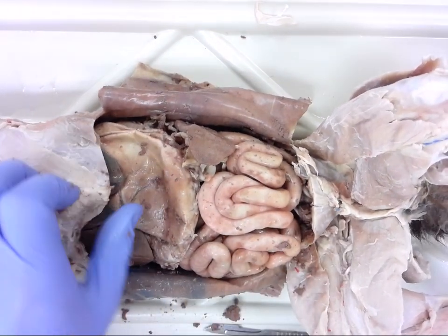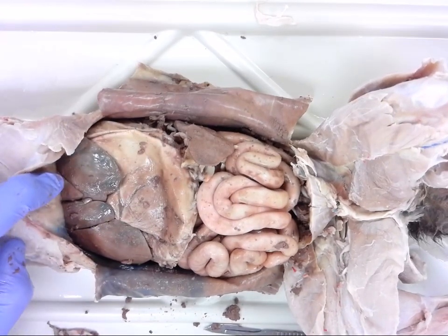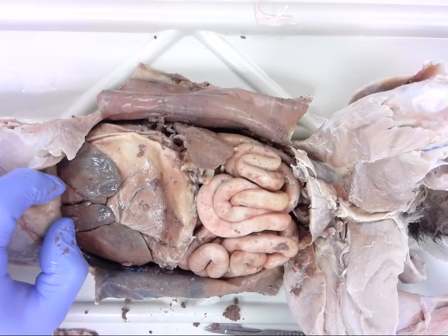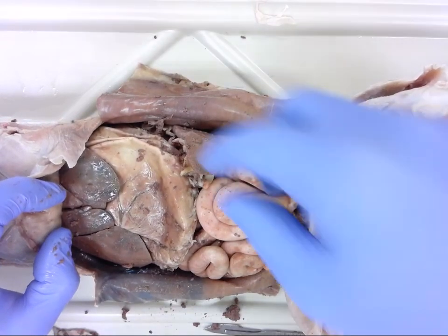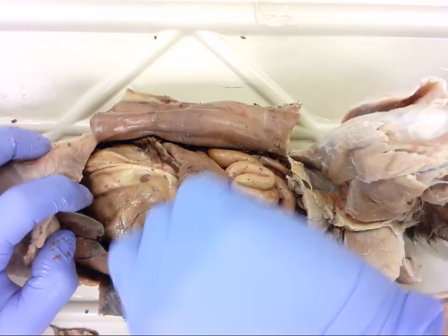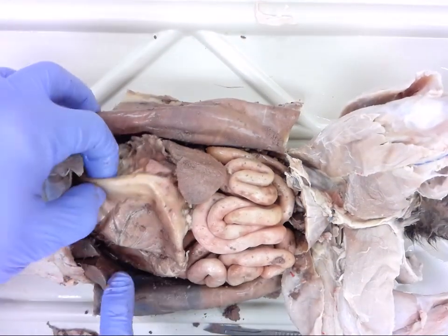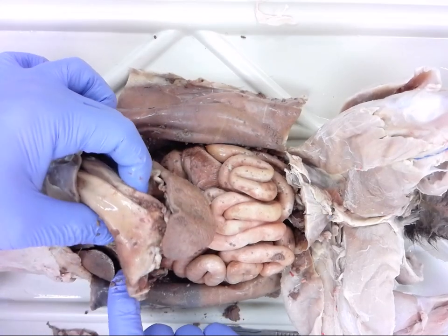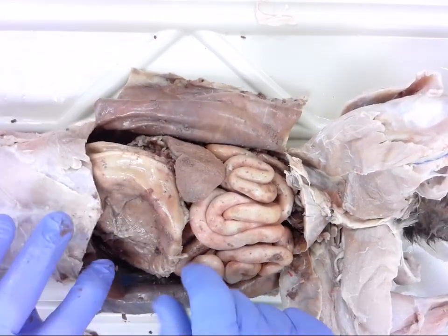So we'll find a couple of different structures here. We have both the digestive tract and some accessory organs, and I will look at each of those at a later point. So the digestive tract, which we're mostly familiar with, has the stomach. That is this. And in this particular cat, it's a fairly large structure. It looks somewhat distended and feels as though it is somewhat full. All right, and we can get into dissecting that later.